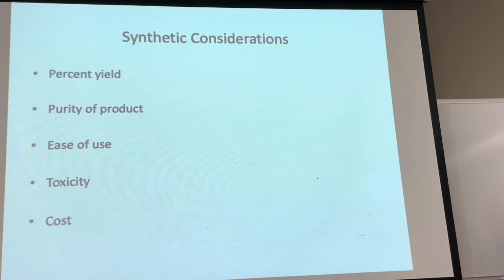Kind of like with the Horner-Emmons reaction where I didn't have you analyze every single spectrum, but just know enough about them to be able to talk about it. You might want to grab a picture of the other methods' NMR, that's going to be the one that's most useful. Just so you can at least have a look at it and see, okay, this one is very, very clean and giving me pure product.